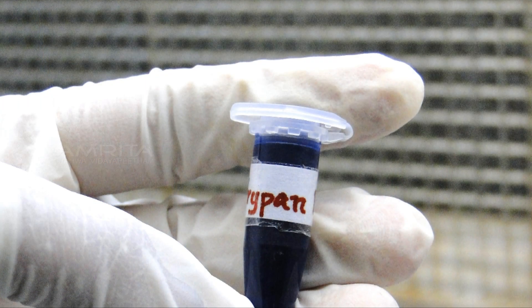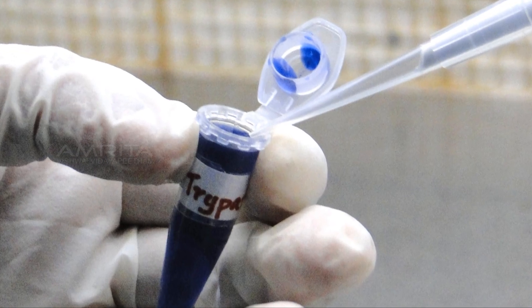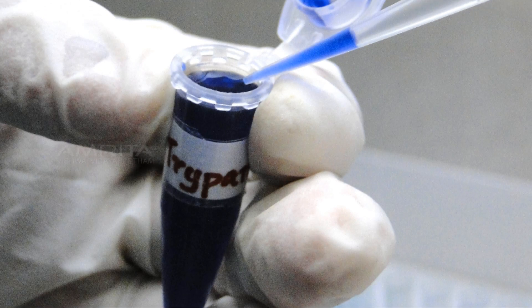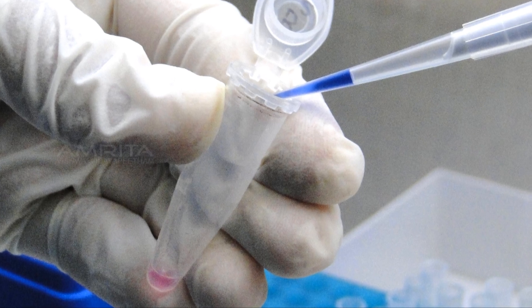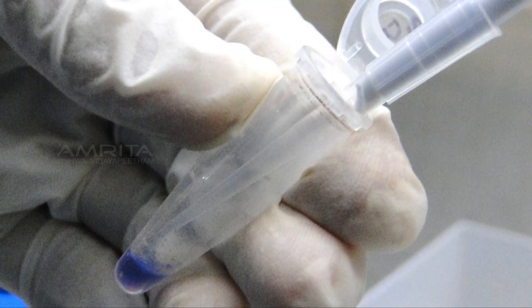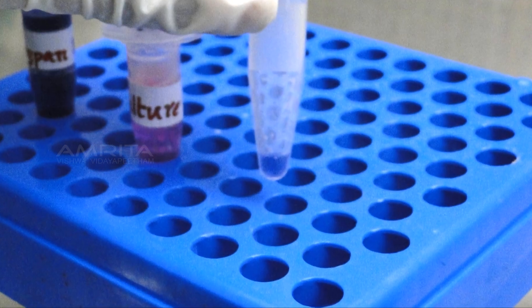Now take the vial containing trypan blue dye, open it and mix 2-3 times with the micro pipette. Take 10 microliters of trypan blue solution and transfer it to the vial containing 10 microliters of cell suspension. Mix the trypan blue cell suspension and keep the vials for 5-15 minutes.